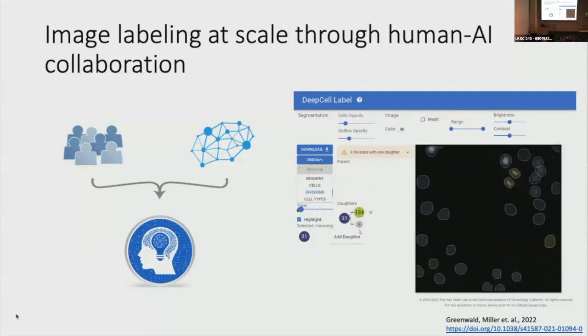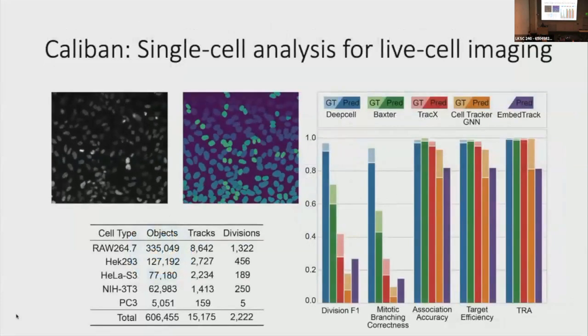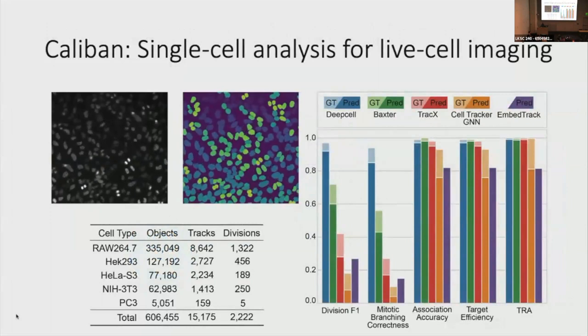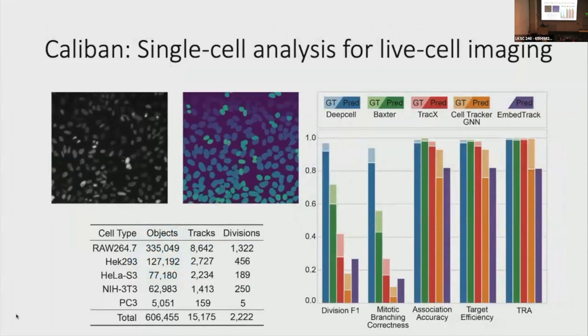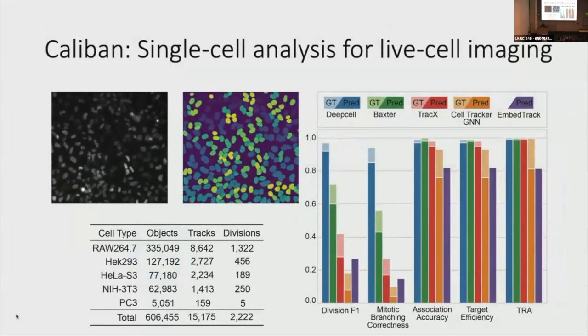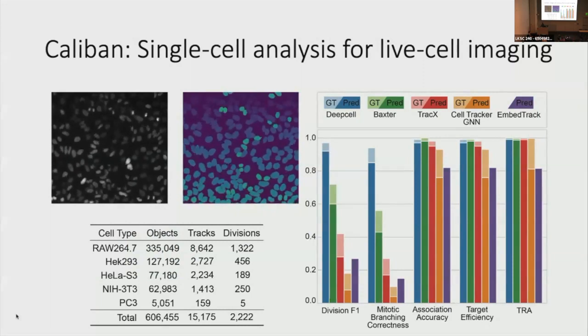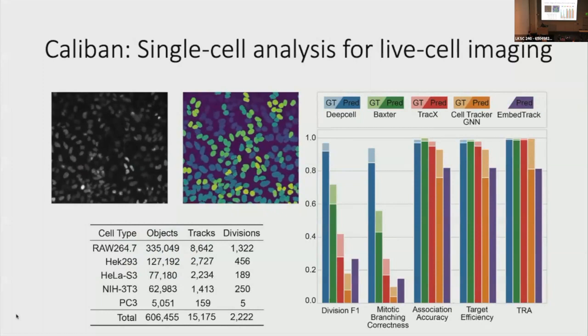And we have different modes for labeling, both for cell segmentation, live cell imaging data, cell phenotyping, et cetera, et cetera. So an extension of the work that Noah presented earlier is that we've actually gotten this human-in-the-loop approach to work for entire movies. We just submitted for publication, and we're gearing up to make the preprint available, work outlining how you can do this sort of iterative human-in-the-loop labeling for dynamic movies.